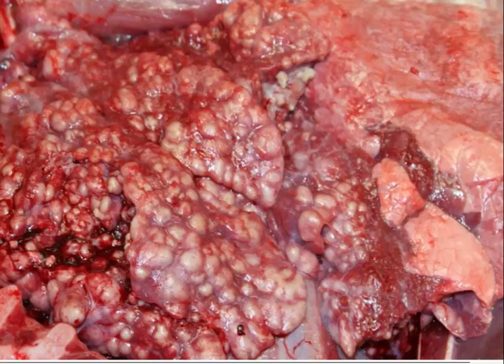Okay, time's up. You probably could have given me a number of causes on this one, but we're looking at the lungs of an ox. You can see that the inflammation is primarily confined to the cranioventral area. So this would be bronchopneumonia rather than interstitial pneumonia. And my morphologic diagnosis is multifocal to coalescing suppurative bronchopneumonia with bronchiectasis. All of these sort of golf ball looking structures are airways which are filled with pus.